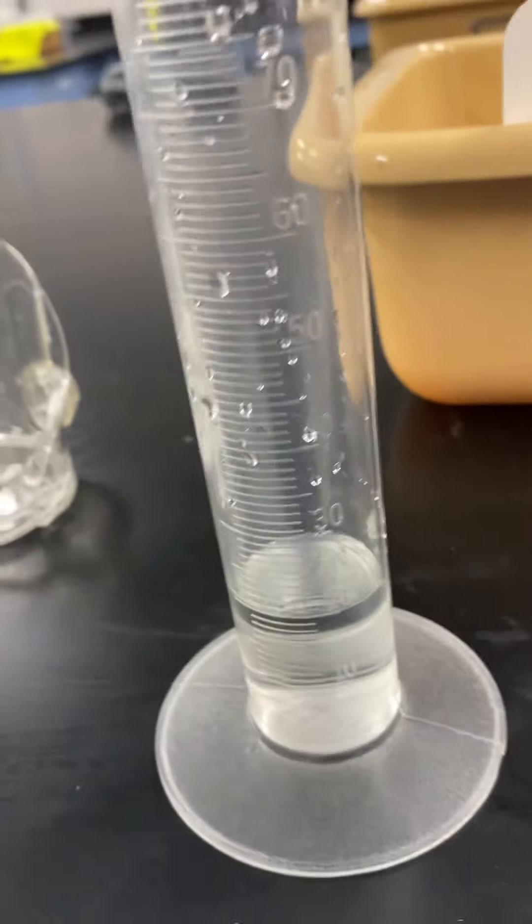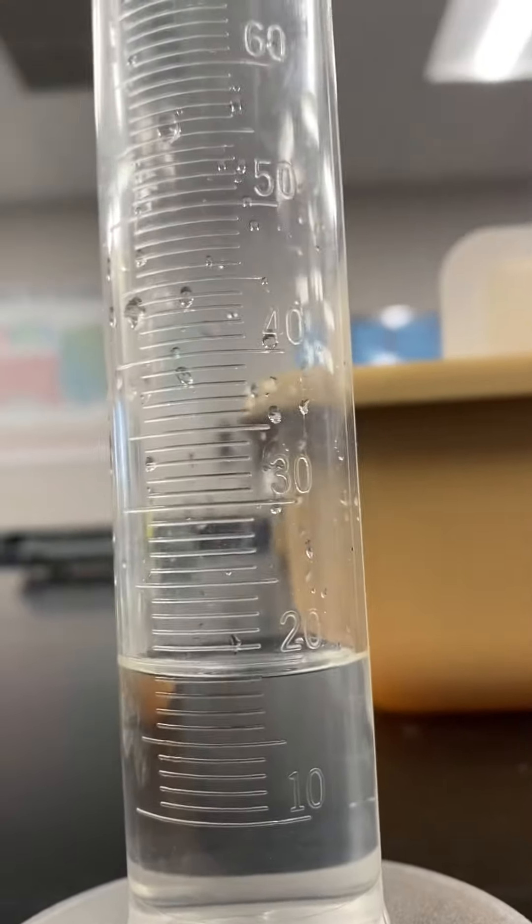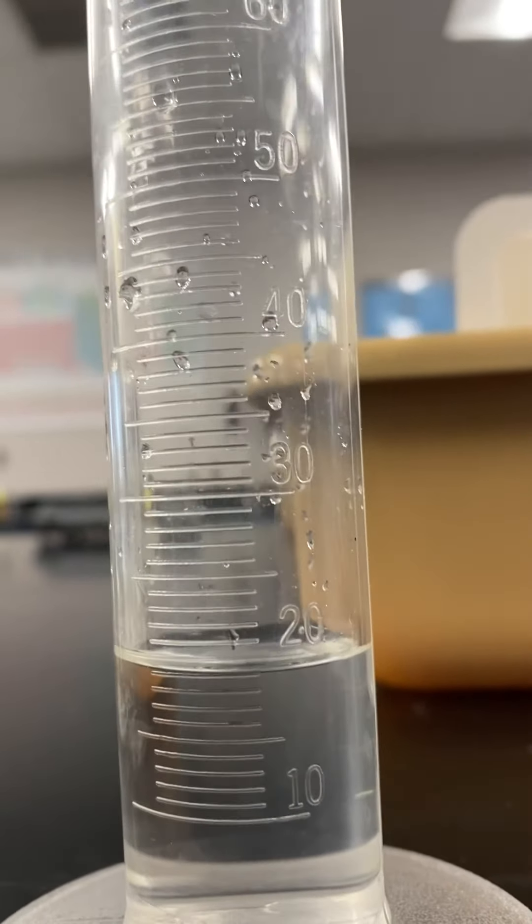All right, that should be about right. If we look down, the meniscus — which is the line of the water — is right at about 20 milliliters.